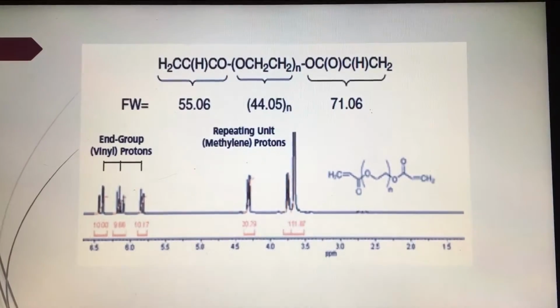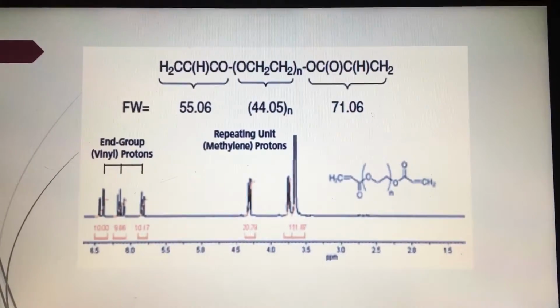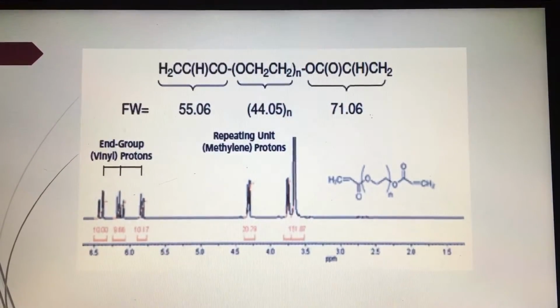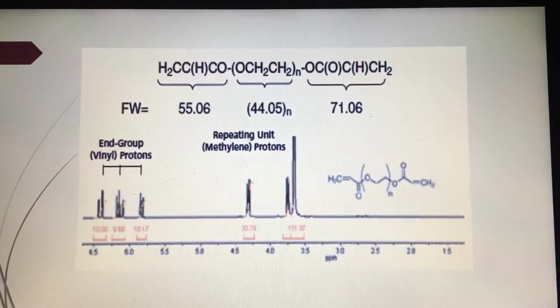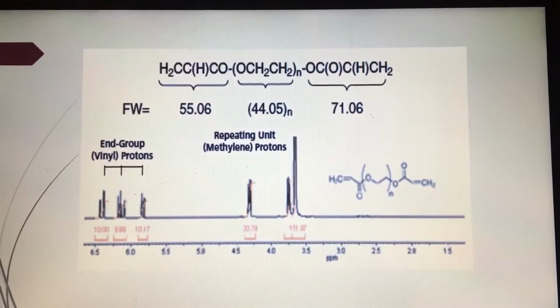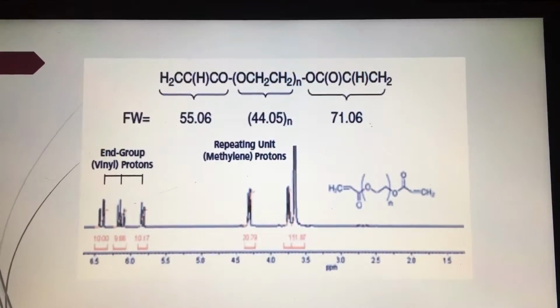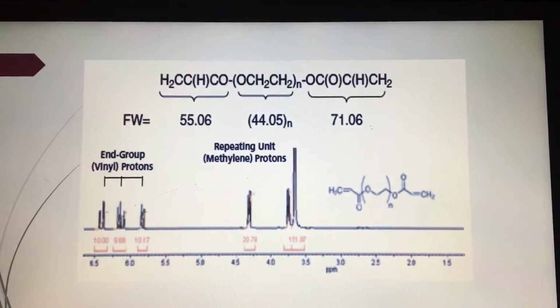Without the use of NMR and other similar techniques, it would be a hard task to identify the chemical bonds that make up polymers and copolymers. In the process, the molecules that move show a peak on the graph and are associated with a molecular weight, which is compared to the known values of the molecular weight of chemical bonds, thus being able to identify the bonds in a sample.